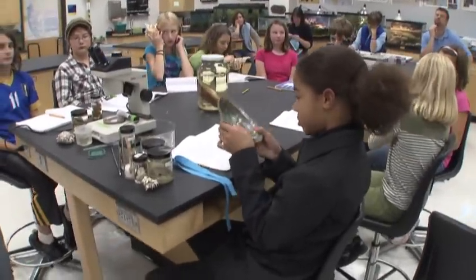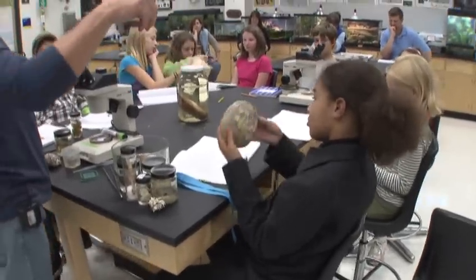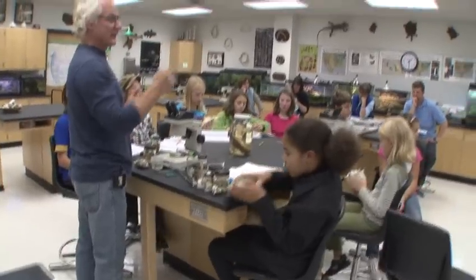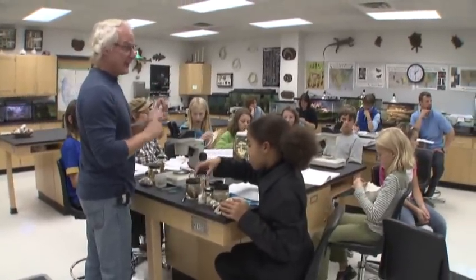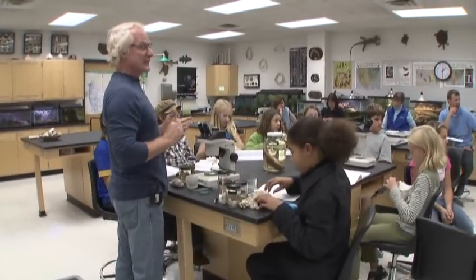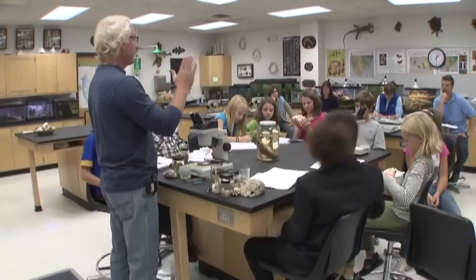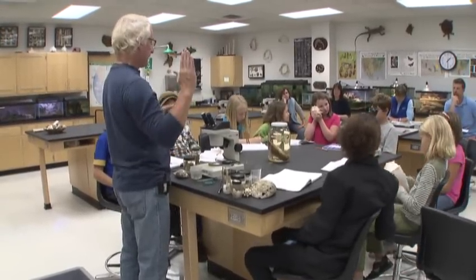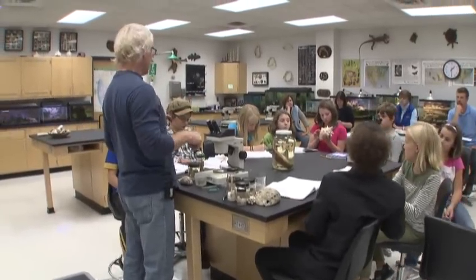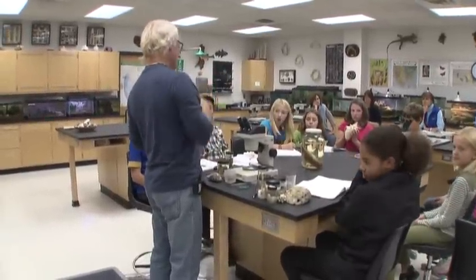So here's what I'm going to have you do now. We're going to go to these different microscopes and you're going to look at things. For example, Brad, you've brought in some egg cases, right? Yep. And you brought in some more of the worms. We have the bristles from the worms. We have snails. You can see the actual foot and the cover that's called the operculum. It actually pops out and then the snail comes out. And if you look at the snail, you'll see it's kind of like a worm too. Obviously, if it's going up this coil, it gets smaller and smaller and smaller, right?